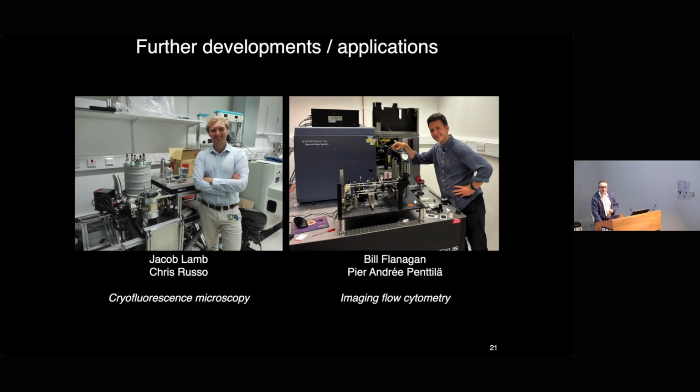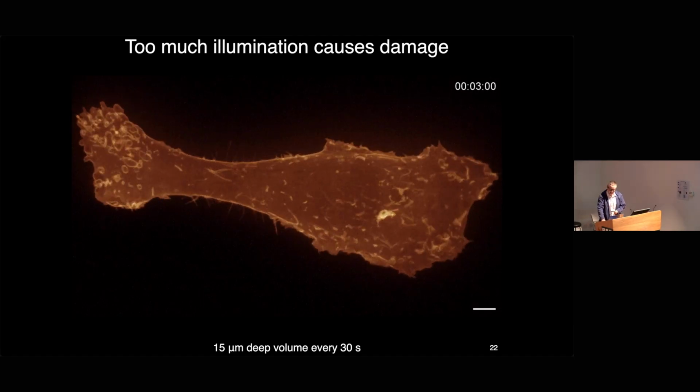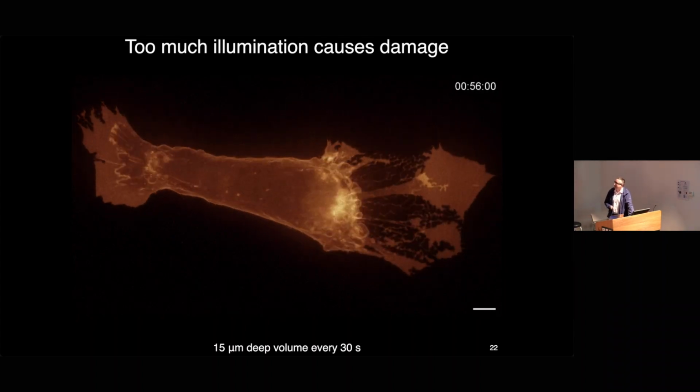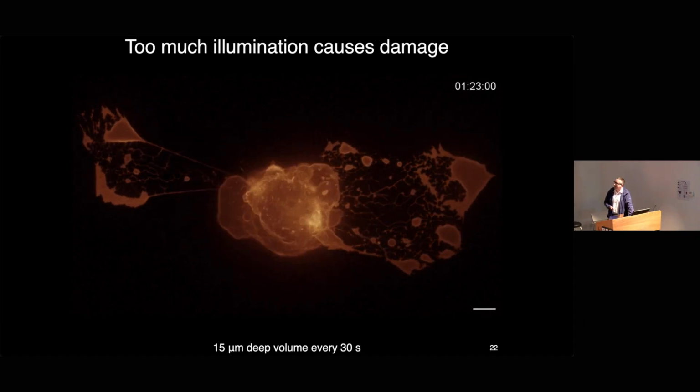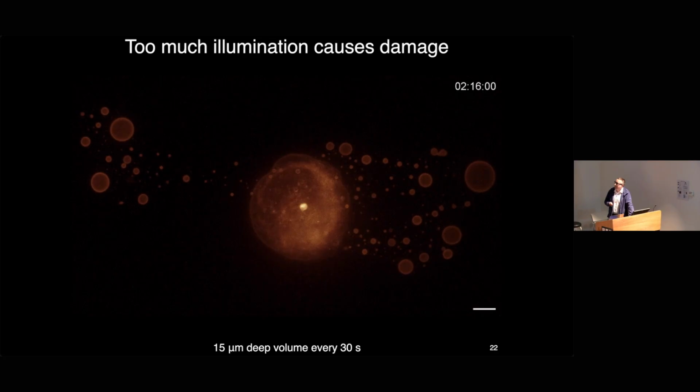So now we move on to the next problem, which is death. Now, death will come for us all, and this is true for your samples as well. And in this case, I've tortured this poor cell by blasting it with blue light while acquiring my movie. And eventually, it kind of gives up. But it just fights on for a long time, until eventually, pop. I'm sorry, but it had to be done.